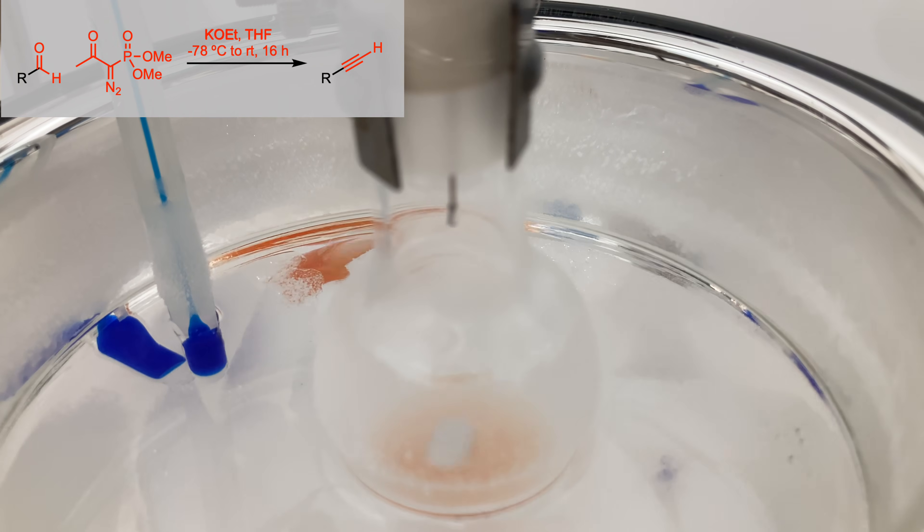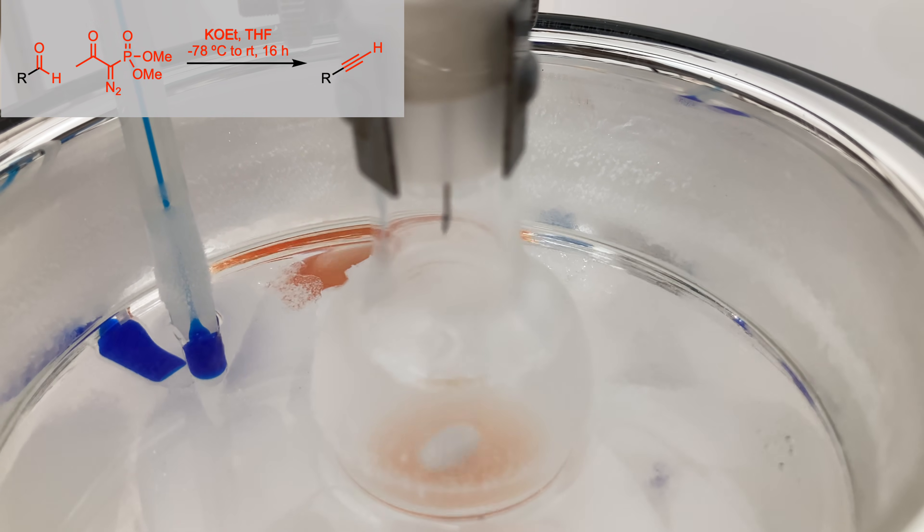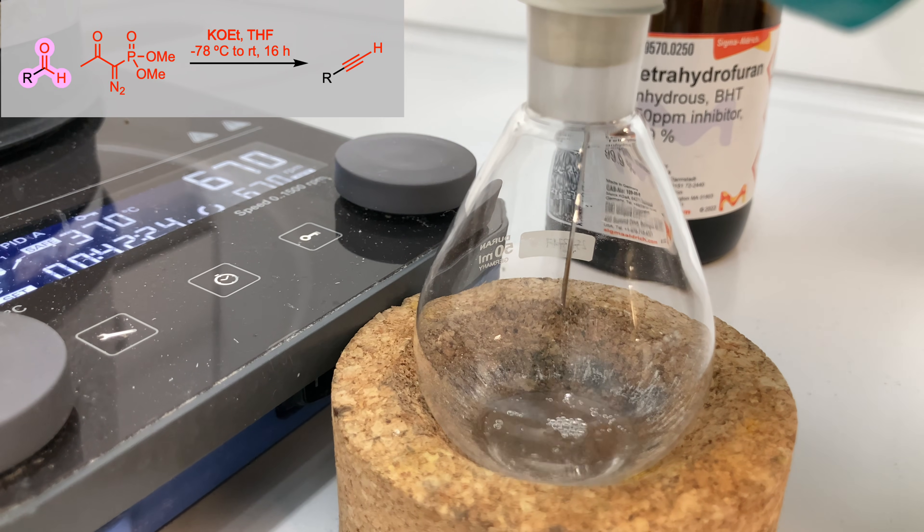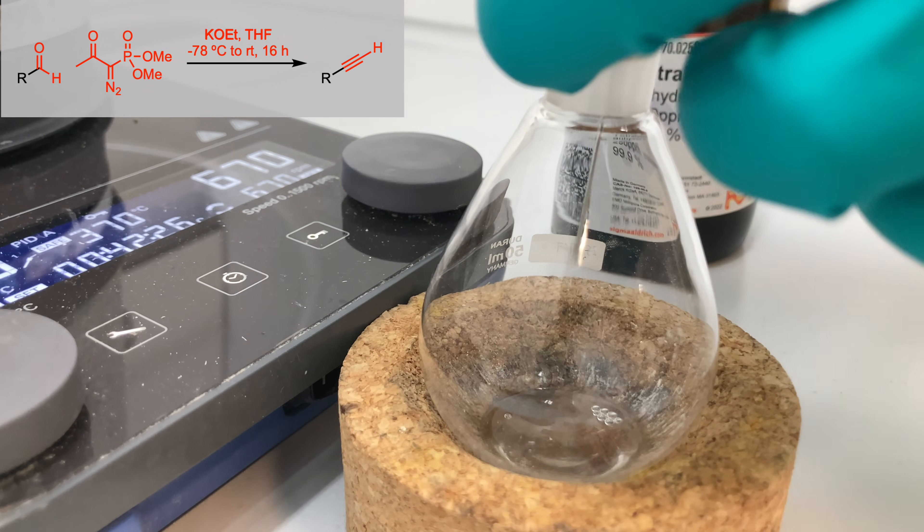As I added the colorless solution, the mixture turned orange almost immediately. After 40 minutes, I added a solution of the aldehyde in THF dropwise to the reaction mixture.